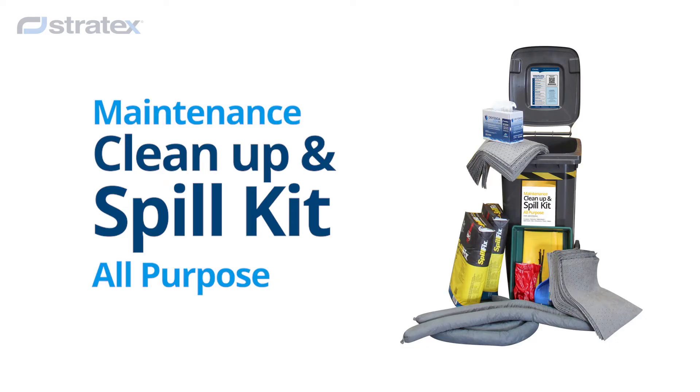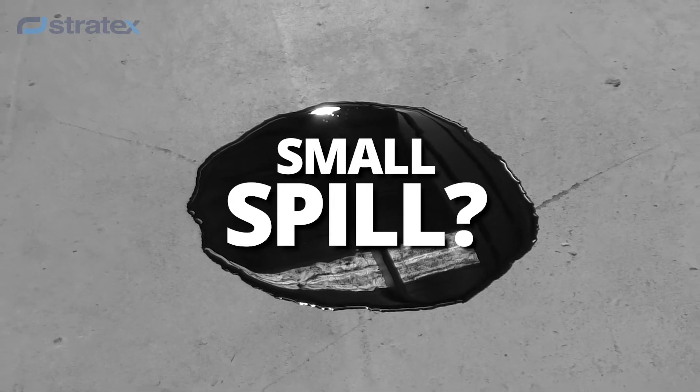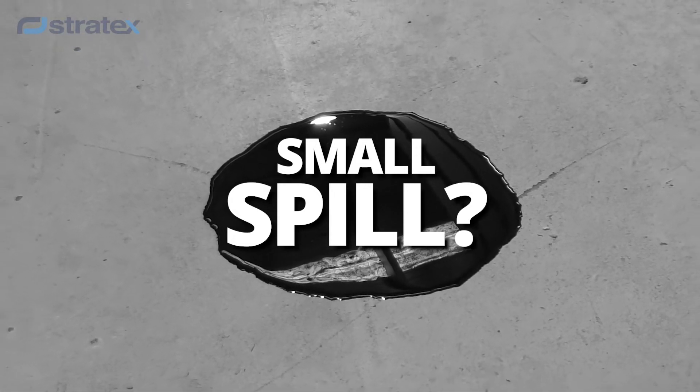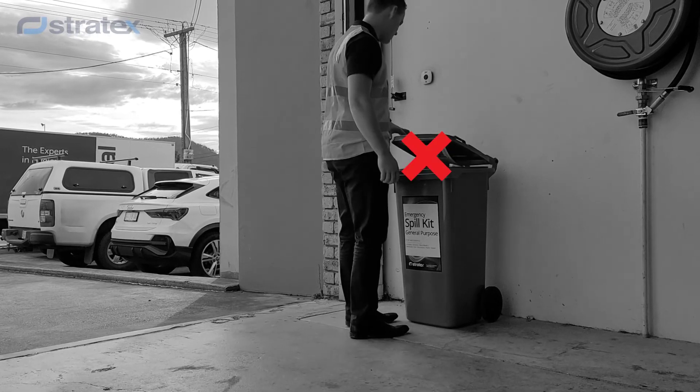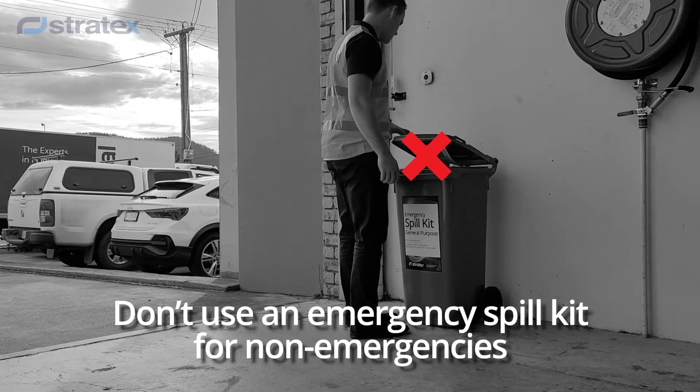Introducing a new product from Stratex: the Maintenance Cleanup and Spill Kit. Picture this — you've had a small spill. You go get some absorbance from your emergency spill kit. Wrong. Using your emergency kit for a non-emergency isn't a good idea. Here's why.